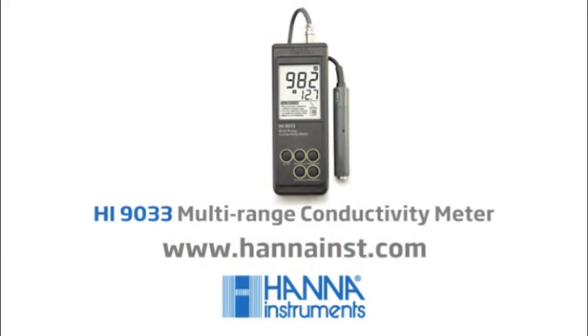On a final note, it's always important to rinse your probe in a sample of the solution that you're going to be testing. Thank you for your interest. Enjoy your product. And if you have any questions, please don't hesitate to contact your local Hanna office. Thank you.